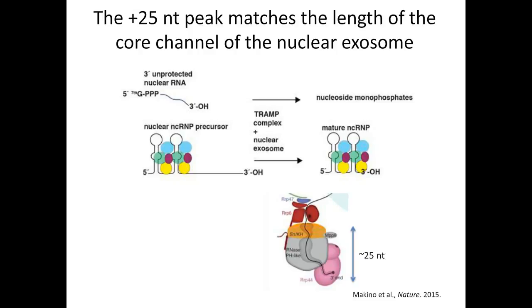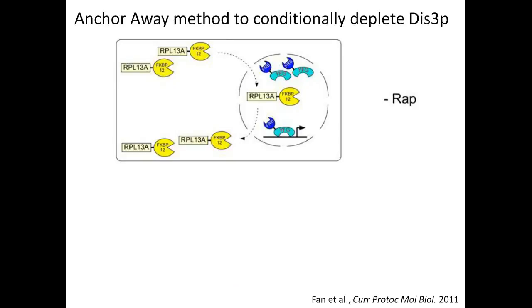However, Dis3 is an essential gene, and so we couldn't simply delete it. So what we decided to do was use a conditional depletion of Dis3 with the anchor away method. The anchor away method is a very effective method in yeast to rapidly deplete nuclear proteins and move them into the cytoplasm. The reason it's so effective is that it involves a very abundant ribosomal protein, RPL13A, that is modified with a tag called FKBP12.